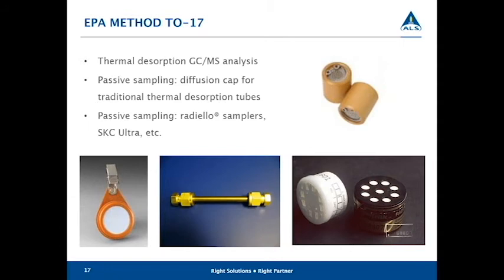For 5 canisters, most of our laboratories can provide that pretty quickly, but the lead time generally is a function of how many cans you want and whether or not it's batch or individual QC. Most of the laboratories can provide 5 canisters or so on pretty short notice.